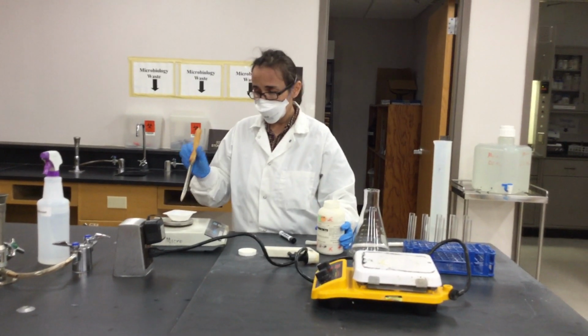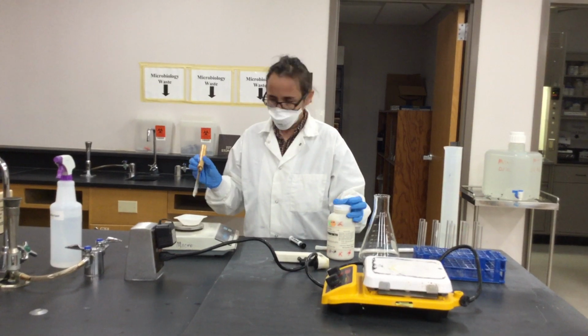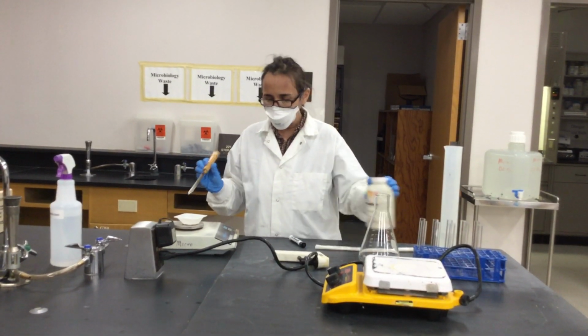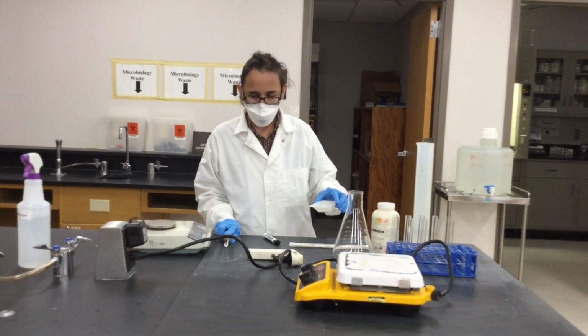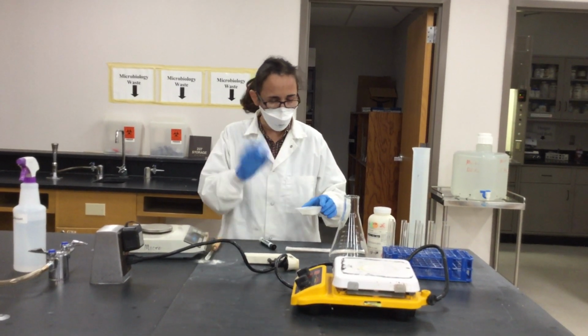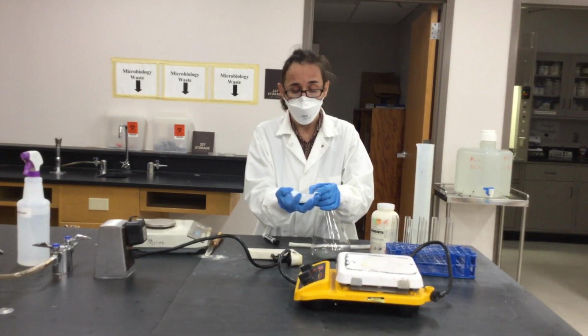And you have to basically have to dig so much with your spatula. So those are 4 grams of media. So I'm going to add this, and also be careful when you're putting your media there. You have to clean up afterwards, okay? I'm going to do that as well.